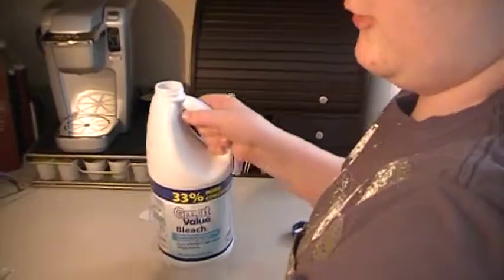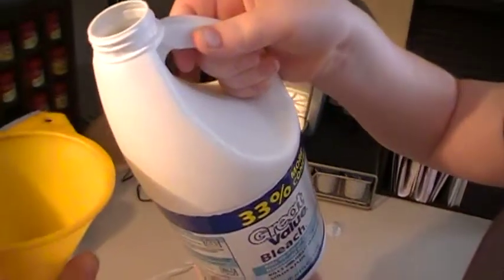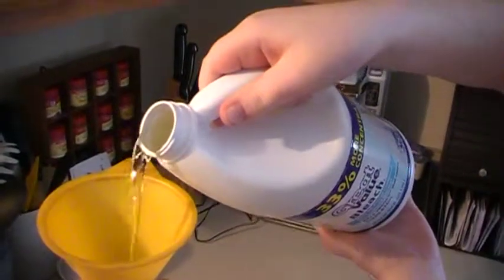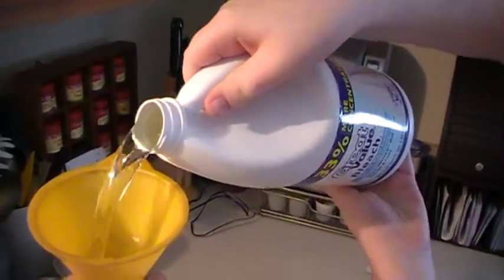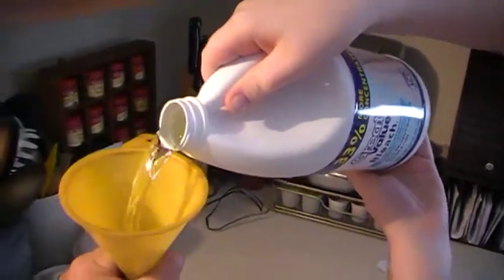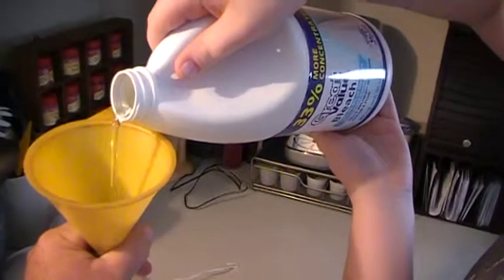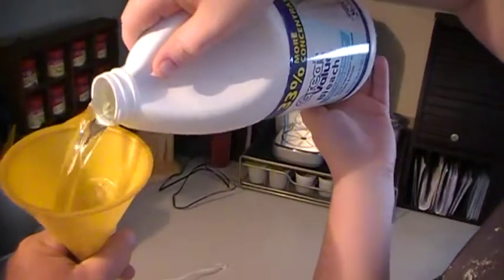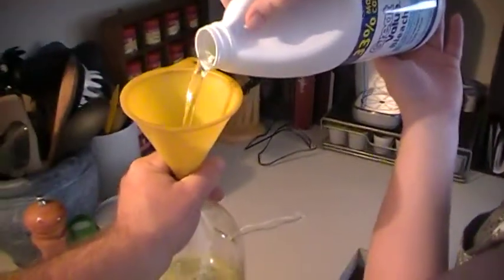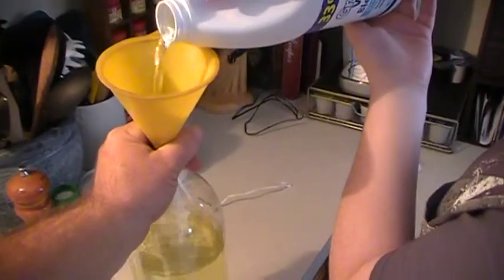Put the funnel in place and carefully pour the bleach inside of the funnel. This is not a waste of bleach because you can always pour it back in the reverse way.